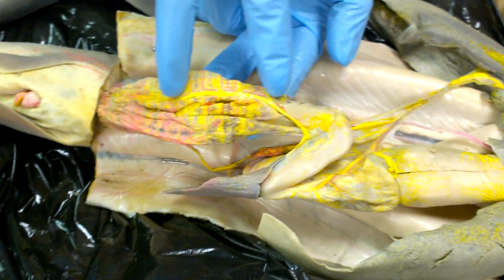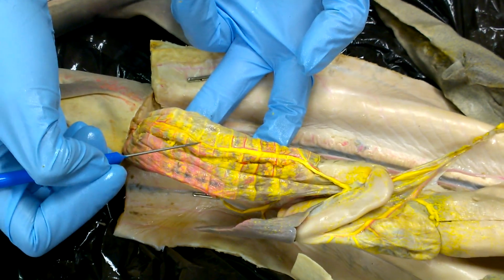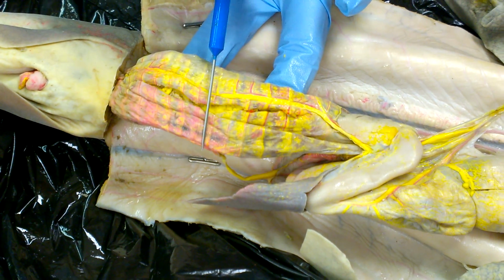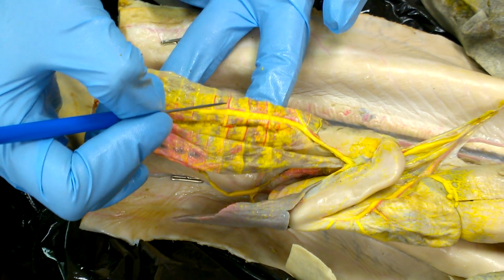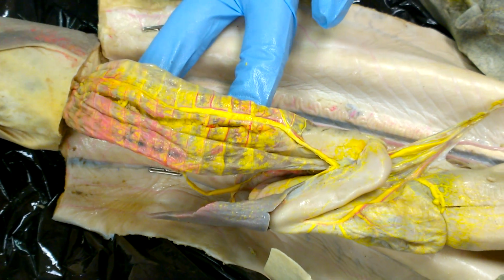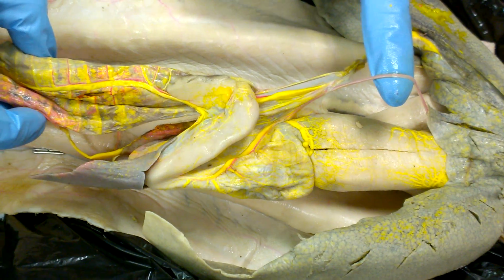Okay. Front is anterior. Okay. And you can see it just dead ends. It just goes to that part and then stops. So it's blood to the anterior intestine only. Okay. And then that branches a bunch of times to make these little arteries that wrap around. Annular arteries. Perfect. Okay, so all of that is off of Celiac. Outstanding.